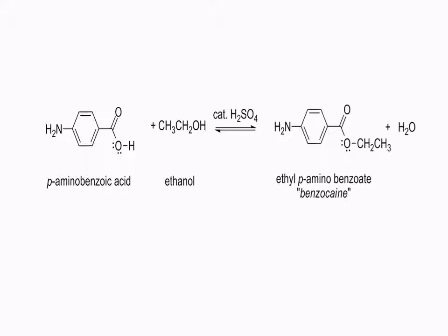This is the scheme of the preparation of benzocaine. The reaction is catalyzed by a few drops of sulfuric acid.